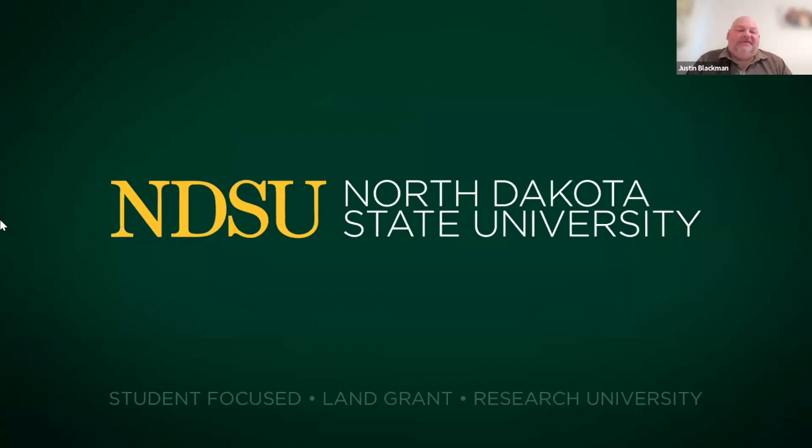However, servicing of newer modern style PIDs has become much easier. They are split into a lamp and electrode stack, which is almost disposable nowadays. I'm sorry, I don't have a slide showing this. I was remiss in that, sorry. But they've become very simple as they've become miniaturized and smaller. The user could now do a simple cleaning, even in the environment of, let's say, the cab of a truck.